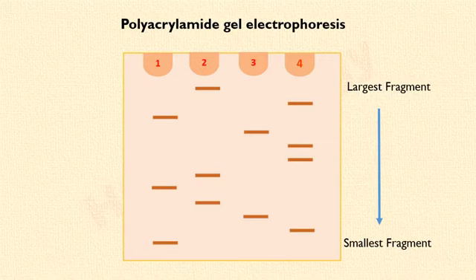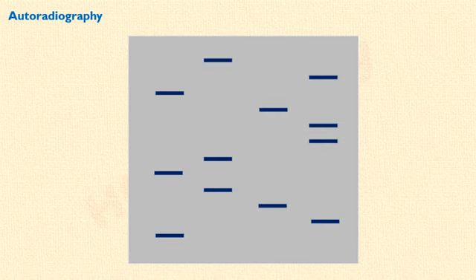The next step is determination of the sequence of the DNA segment. Since Sanger radiolabeled the primers in each reaction mixture, an autoradiograph of the gel was obtained. An autoradiograph is a photograph of the gel produced by radiation from radioactive material present in the partial DNA fragments in the gel. Let's say this is the autoradiograph of the gel. We will label each lane according to the ddNTP with which the partial DNA fragments should end.